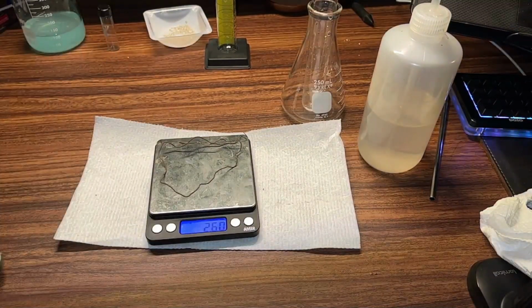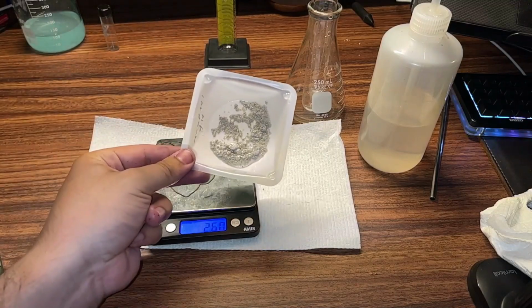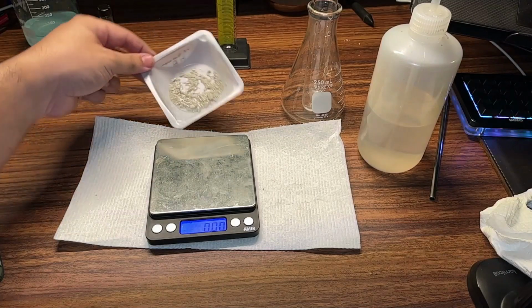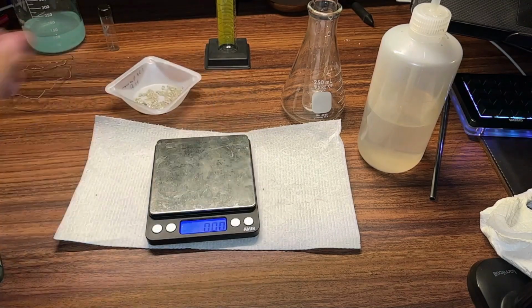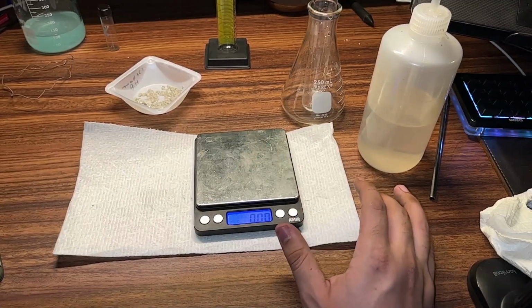Actually, it doesn't conclude the lab because I still need the mass of my silver after. I'm going to let that dry for a bit, and then I'll show maybe just a picture of the mass. I don't want to hook my camera back up again. But then, yeah, I'll get this video uploaded tonight, so that way y'all can watch it first thing tomorrow.